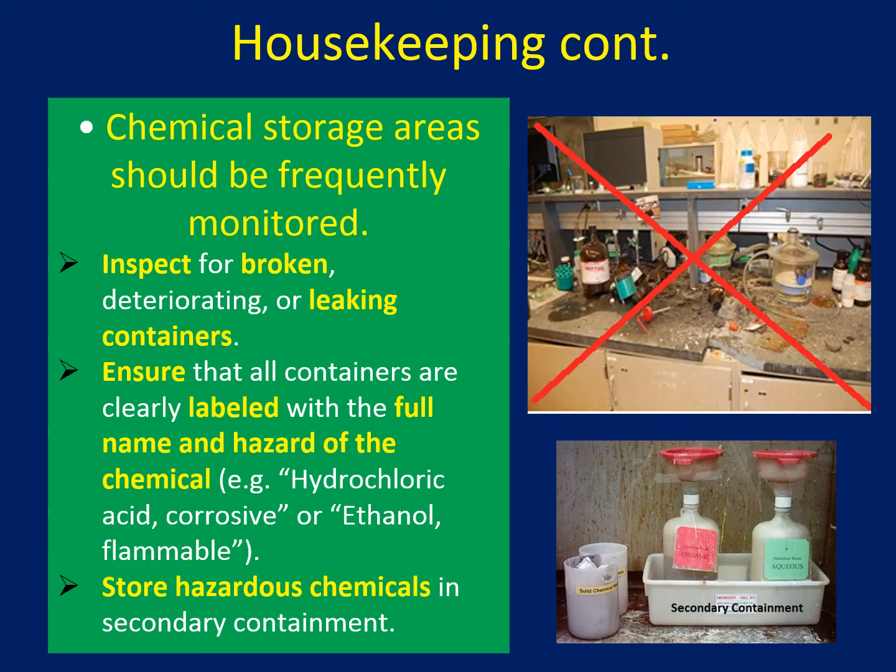And then you have to keep all the chemicals in a tidy manner. So inspect broken glassware or leaking containers and make sure that all the glassware and all the chemicals are labeled with full name, and if it is possible, please put the hazardous symbols, because without the labels it's very dangerous. Somebody coming from outside into the lab doesn't know whether it is water or hydrofluoric acid, right? If somebody thinks it is water but it is hydrofluoric acid, what kind of things can happen?